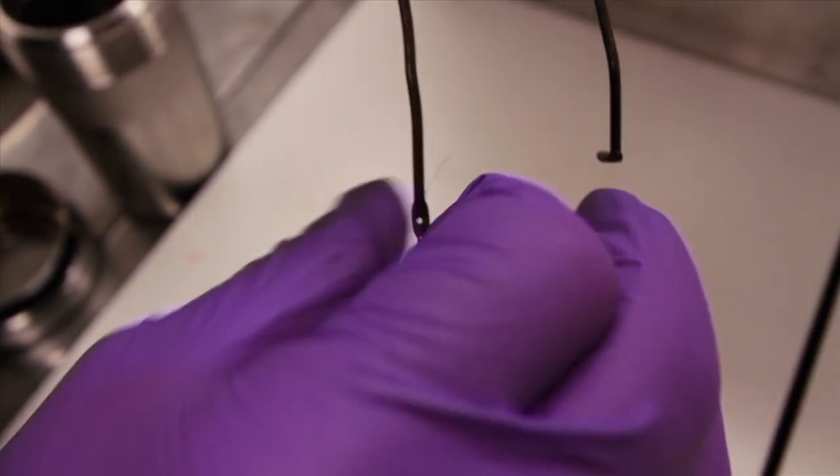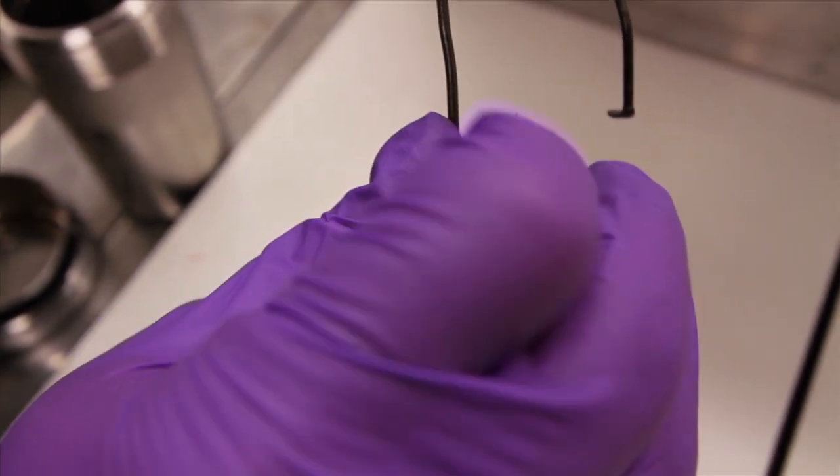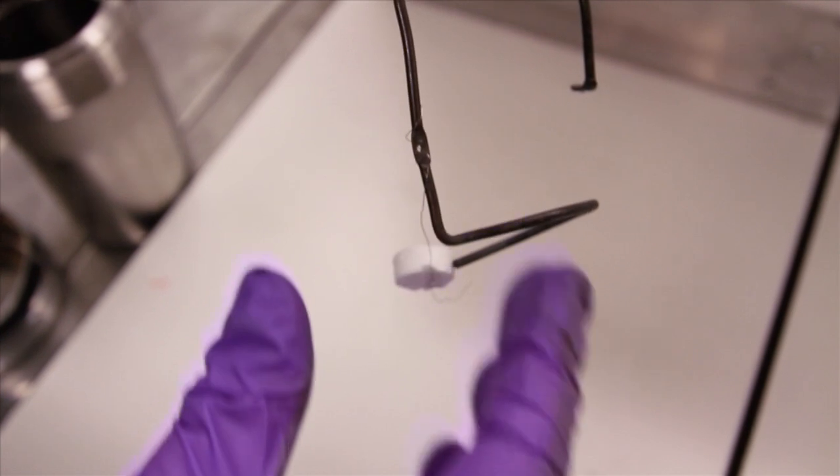The fused sample and wire are loaded into the calorimeter by threading the wires through the small holes on the lead inside the bomb.